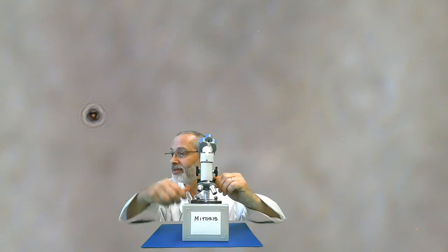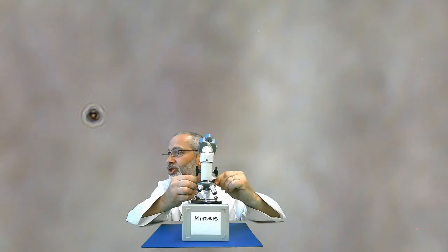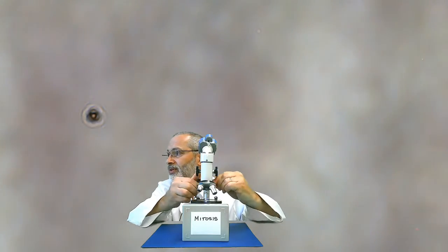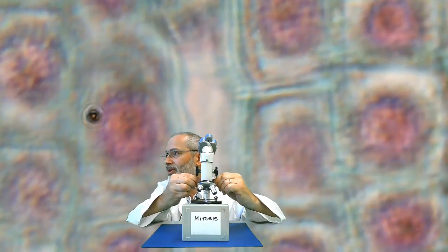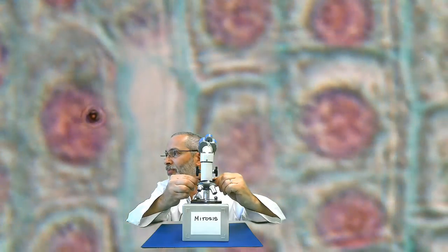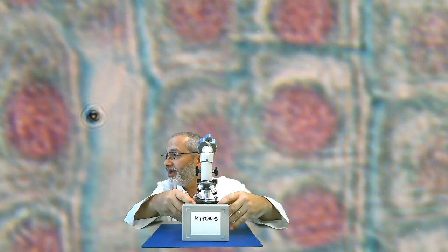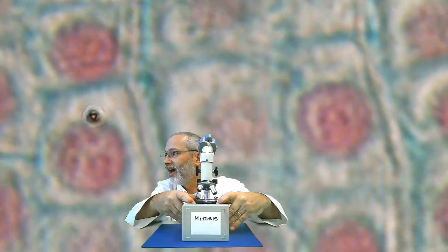Camera just is compensating. Use only the fine adjustment knob to get our view into focus here. And we're getting closer. Getting close. Oh, check it out. Now we're under high power magnification. And we are viewing individual cells at this time.